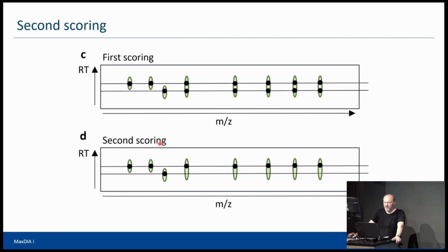And so now we apply some rule so that every fragment is only used for one consolidated library spectrum, right? So you see now that these matches here, the lower ones, for the ones that have 2, are not here anymore. It's a little bit like the Occam's razor principle that we also apply for non-unique peptides, where we want to decide to which protein groups they belong. It's the same principle. So we say, okay, the ones that were hit by 2 library spectra, if I would have to decide for one, I would say it probably belongs to the one that already has more unique fragments found, basically.